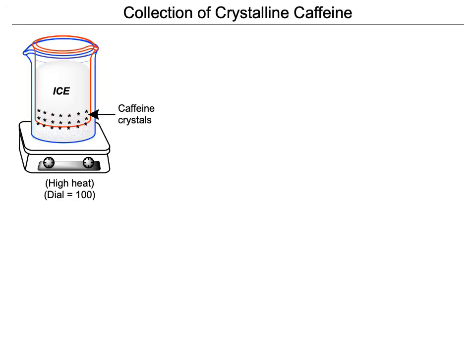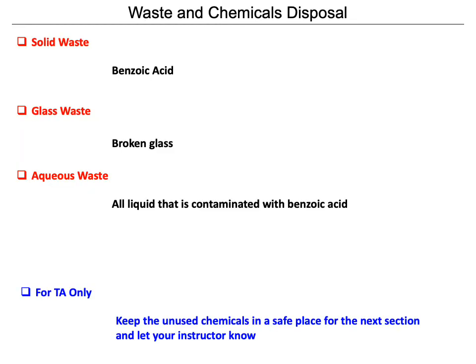This is what is going to happen. You need to scratch the caffeine crystals from the exterior wall of the smaller beaker, and at the end you see what is waste, and we need to throw those waste materials into the designated area.